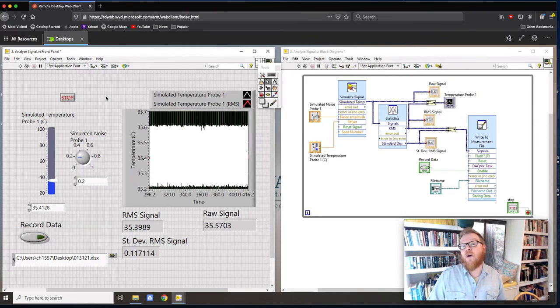We wanna create a new file. I fully recommend that you do that. So I fully encourage new files for each day where that file has the day's date, okay? So now what I could do in here, based on what you just saw, is do this preemptively by just going in here so I can edit this on the front panel, instead of editing on the block diagram.